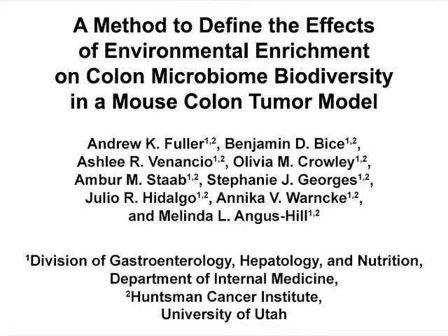The main goal of this publication is to present a method for normalizing the microbiome of rodents. In this demonstration, the effect of environmental enrichment on the microbiome is assayed during colon tumorigenesis. This protocol shows how normalizing the microbiome prior to an environmental enrichment intervention improves experimental reproducibility.